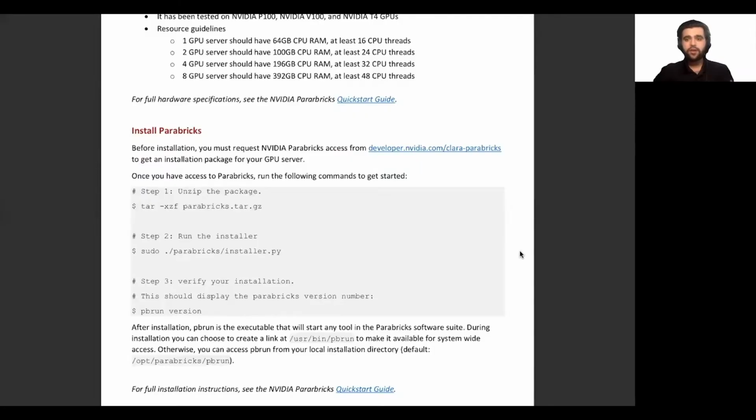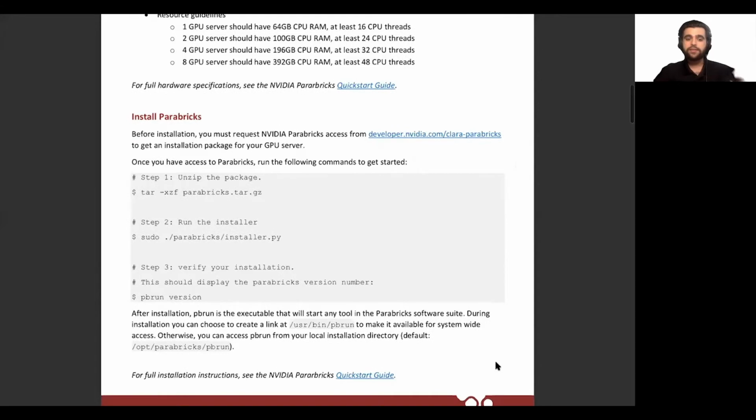So in this video, I'm going to go ahead and gloss over installation, since this is more of a demo video than an installation video. But within this document, we give you some resources, the overall process, who you need to reach out to at NVIDIA, and how to actually install, as well as a link to the full installation instructions on the NVIDIA Parabricks Quick Start Guide. So for the sake of this video, I'm going to go ahead and assume that you already have Parabricks installed.